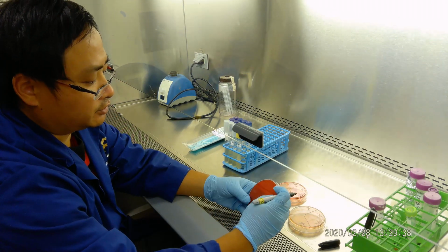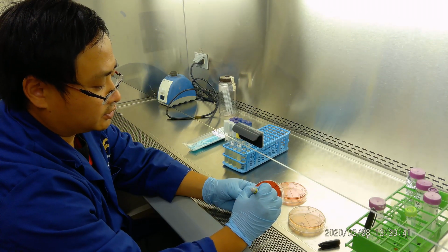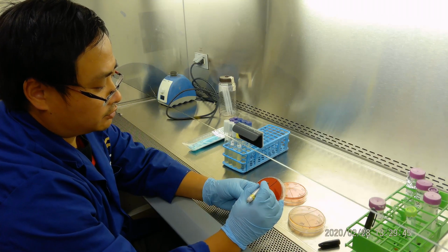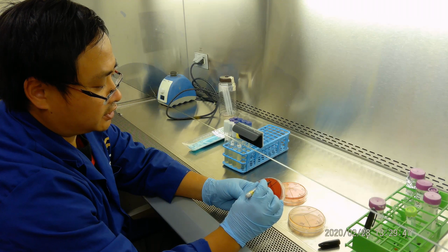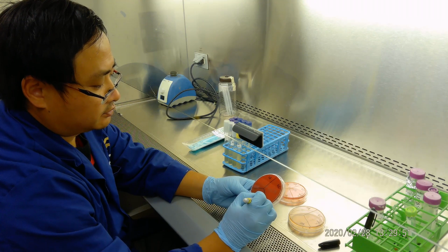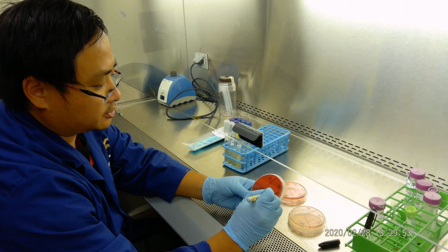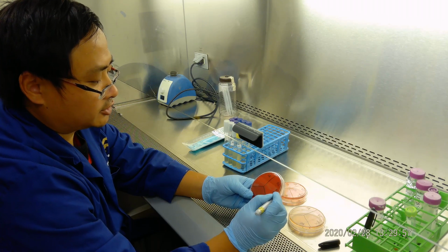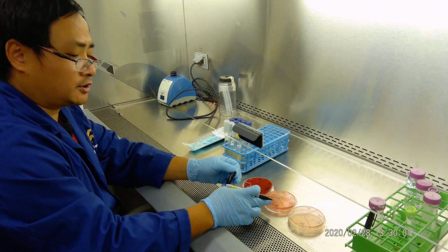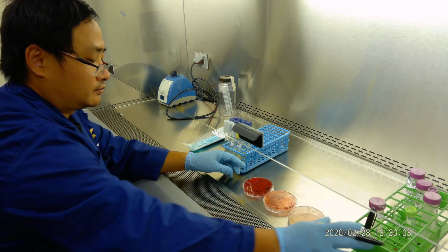This is the blood agar. We do the same thing. We split it into 3. So we have Staphylococcus aureus, E. coli, Pseudomonas aeruginosa. We're going to write initials, date, and bench number. Okay. After doing this, take a picture right now of the whole set.